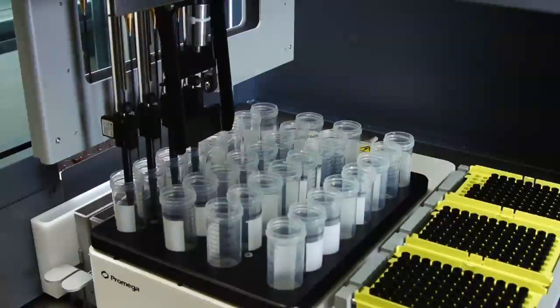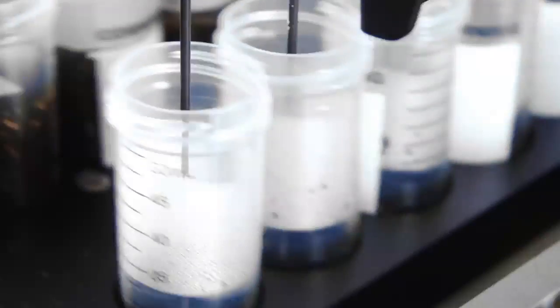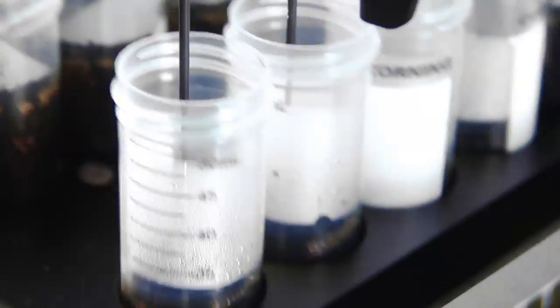The instrument detects the liquid level in the processing tubes and then calculates and adds the optimal amount of reagent for each sample.